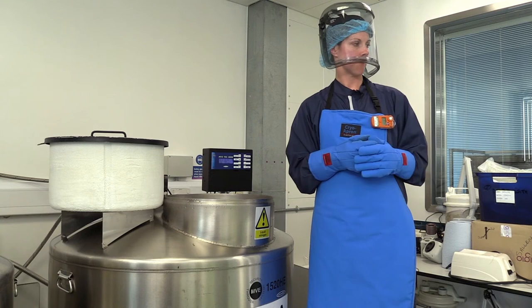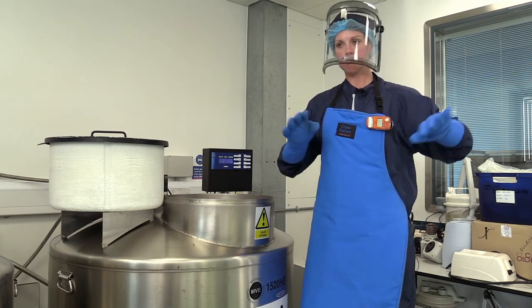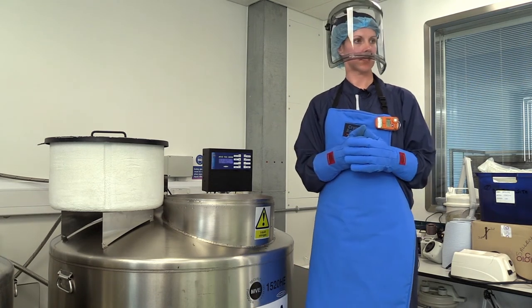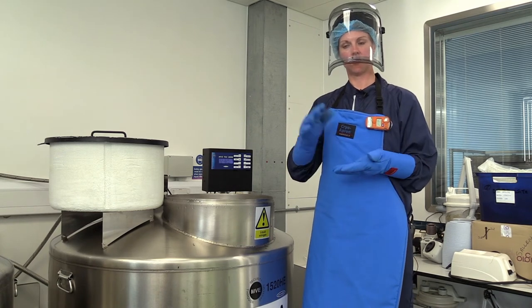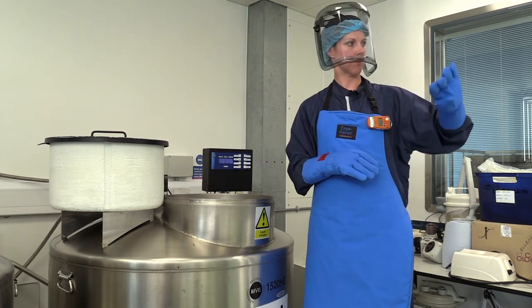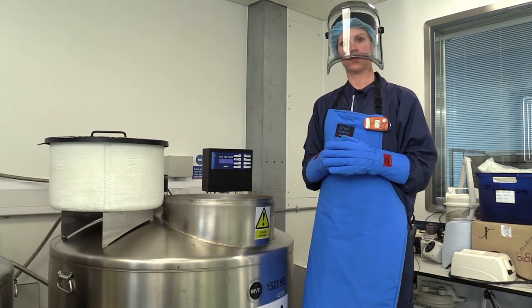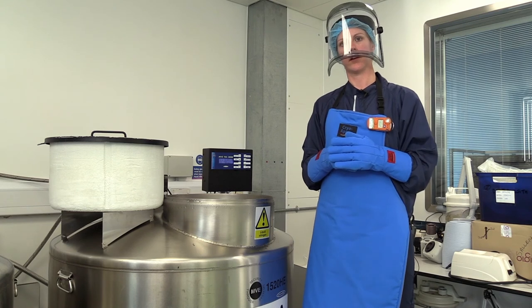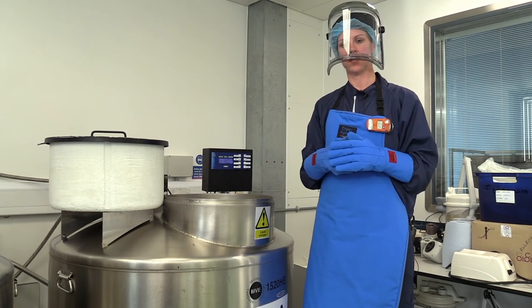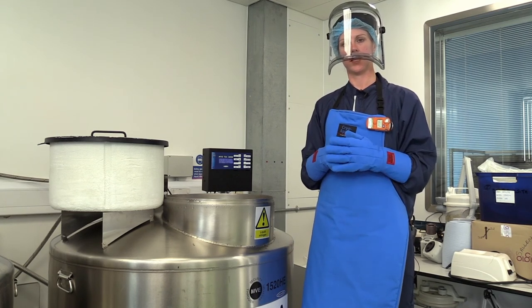We also have panic alarms around the building. If the oxygen concentration gets too low, we can press one of the buttons on the way out to stop the liquid nitrogen supply and increase the ventilation, just to keep us safe.